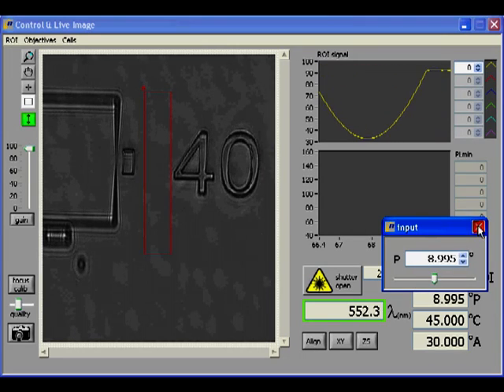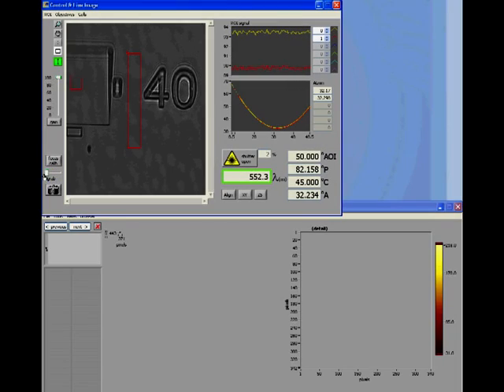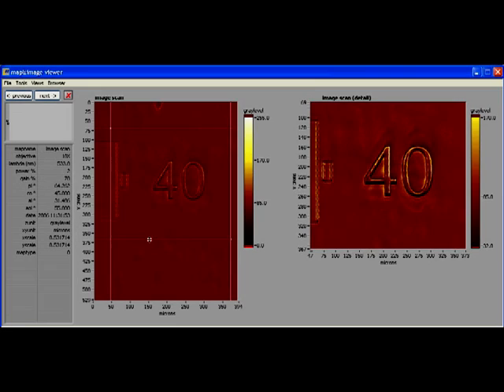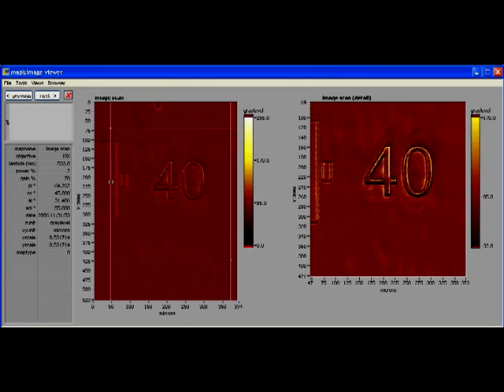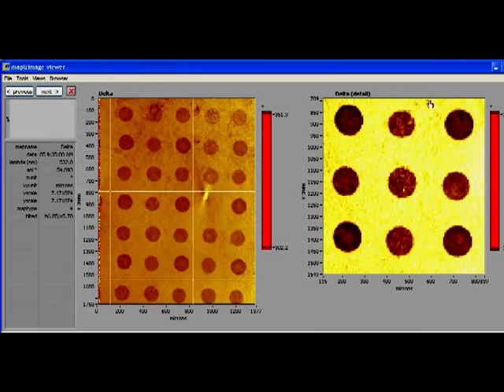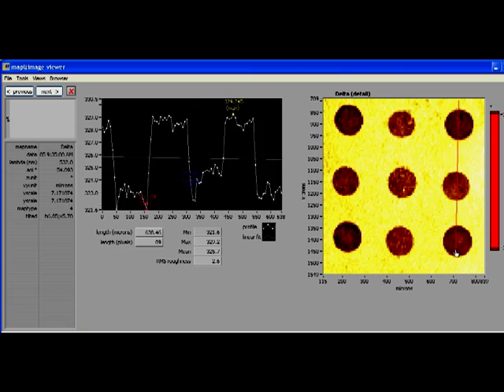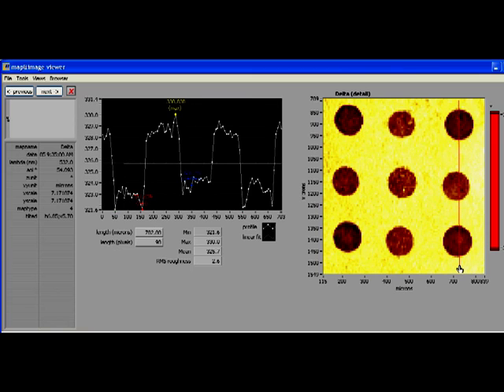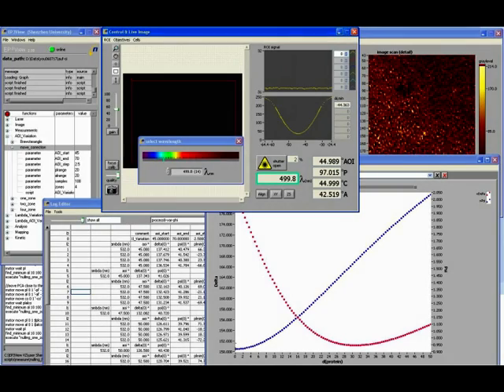Whereby subtle layer distinctions become visible. Having adjusted the optical contrast, you may now obtain and process images. The EP3 View software comprehends the entire image processing, including the measurement and profiling of structural elements. The imaging, however, is only part of the potential of the EP3.